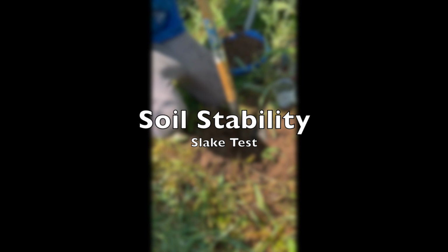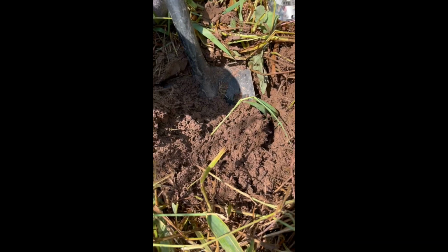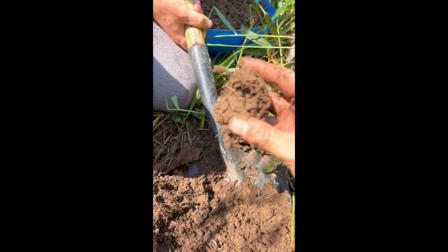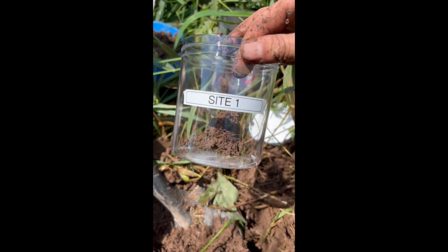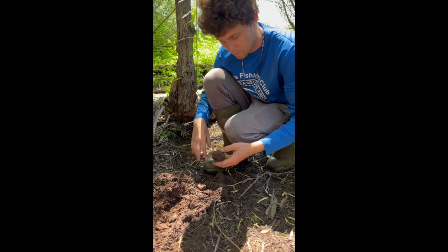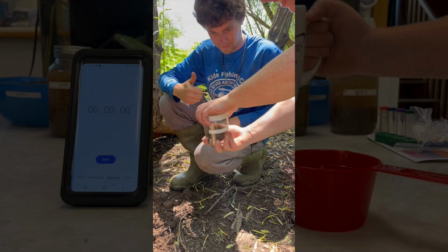Next up is a soil stability test. This test determines the aggregate stability of your soil, meaning how well the structure withstands external forces acting on it. You will need a jar container that is at least 5 inches high, a wire mesh or chicken wire, ideally 1/4 inch wide for the holes, water, a golf ball clump of soil, and a stopwatch.